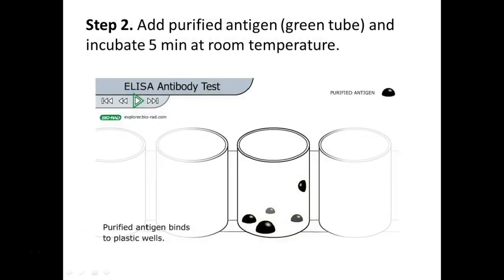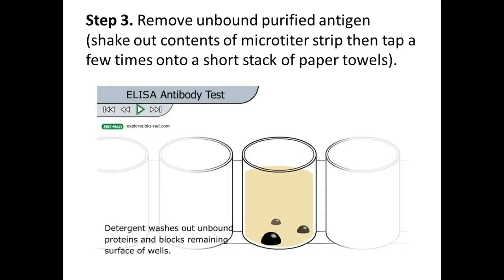Step, and I'm going to hit pause. So we just did this step, so we've got 5 minutes to kill, so let's talk about stuff. What you're going to do after our 5 minutes are up is, as I said, I'm going to show you how to dump this so you don't cross-contaminate your wells later on when the wells are different. Right now they're all the same, but good technique is important.